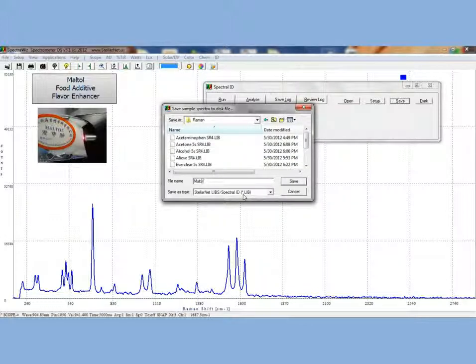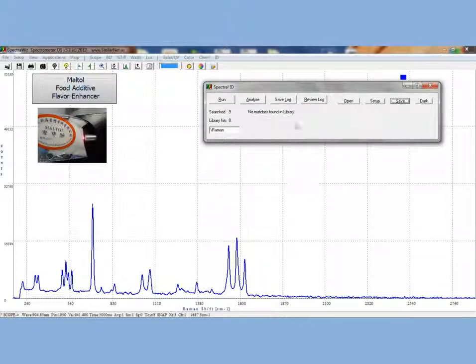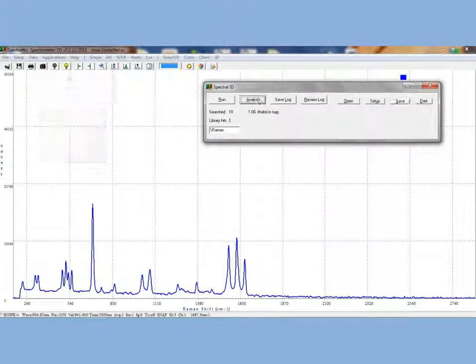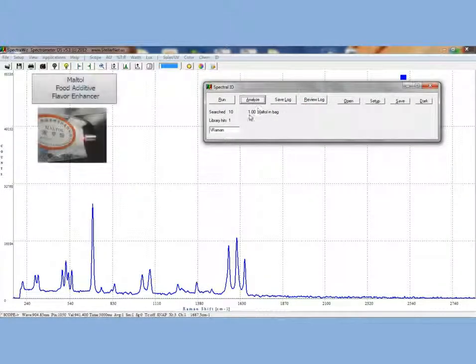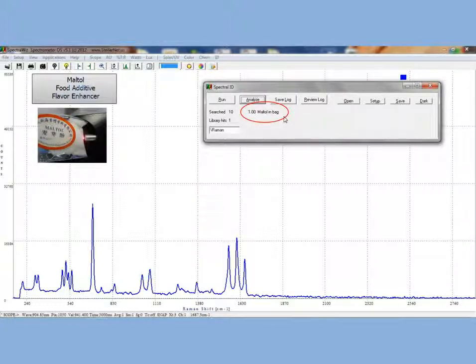We will save this one as maltol in a bag. Now when we click the analyze button, we find a 100% match to maltol in the bag.